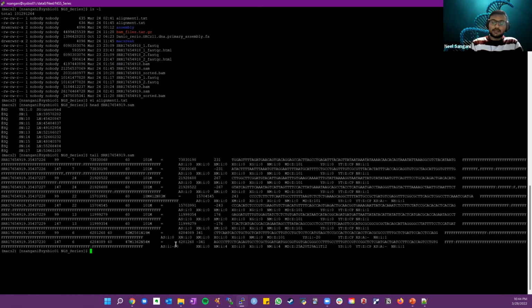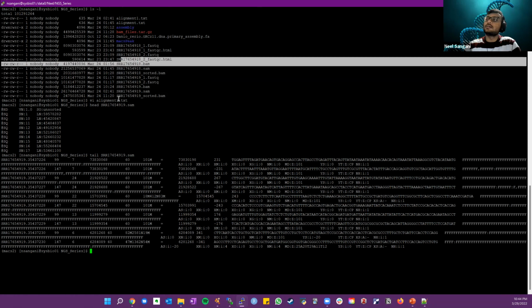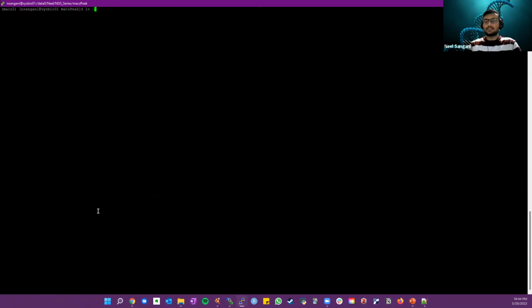Once you have the SAM file, we convert it into BAM files, and you can see up here that I've converted these SAM files into BAM files. After converting these files to BAM files, I'm doing the peak calling, right? For peak calling, I am saving my results in macs_peak. So let's clear this and see what we have in this folder. We have three things.